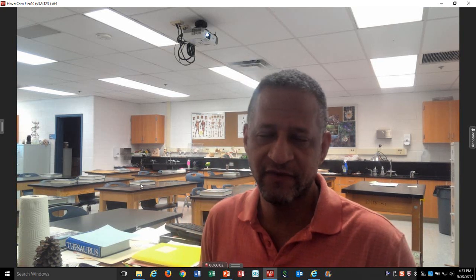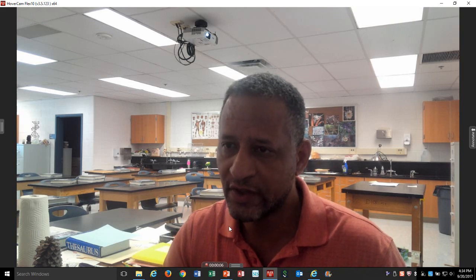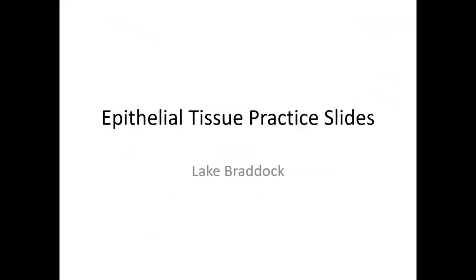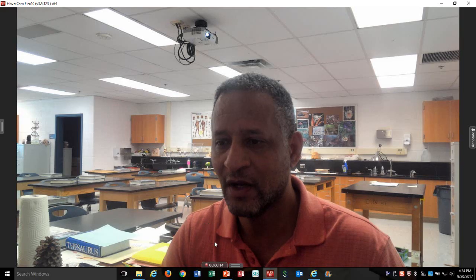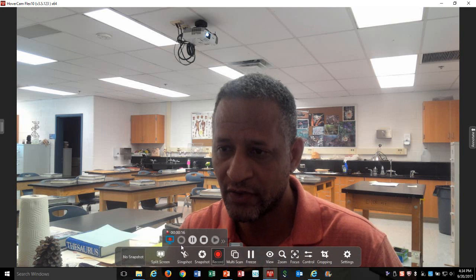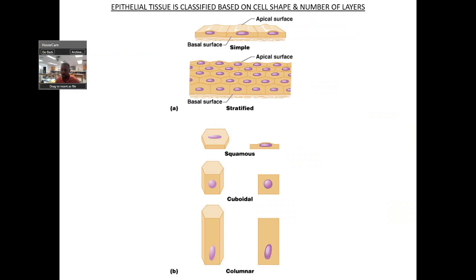Let's practice identifying different types of epithelial tissue. We're going to do some practice for our epithelial practice slides, brought to you by Curious Murrayland. What I'm going to do first is review the different things you need to focus on when you're doing epithelial.